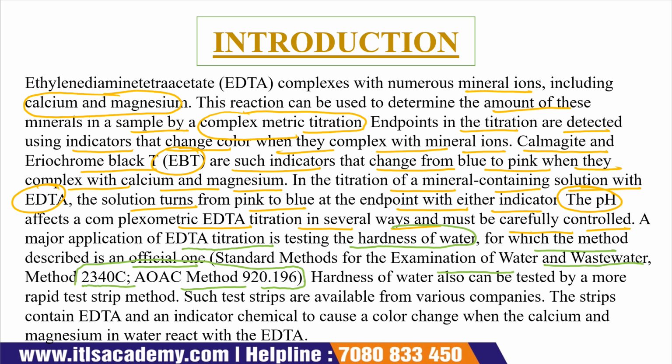Now, hardness of water can also be tested by a more rapid test strip method. The second method is the rapid test strip method. So we will discuss both methods. The first one is the EDTA method and the second one is the rapid test strip method. But in this class, we are only focusing on the EDTA method for the determination of the hardness.